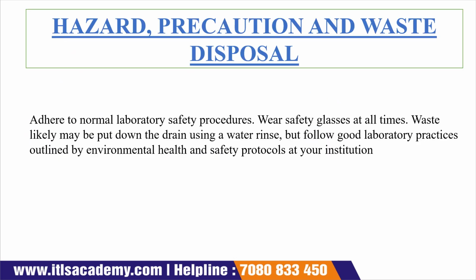Now the next one is hazard precaution and waste disposal. We are using the phosphoric acid solution, so we have to take care because it is a chemical, and when handling a chemical we have to take extra care. Along with it, we have to follow normal laboratory practices. We have to wear safety glasses, a lab coat, proper shoes, and gloves because we are handling a chemical.